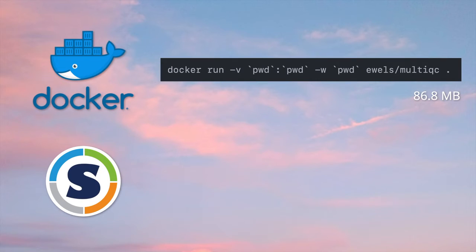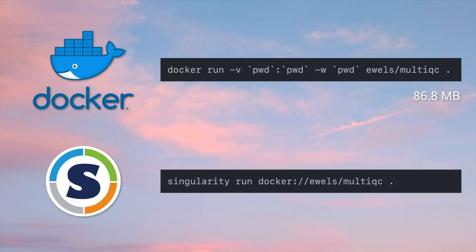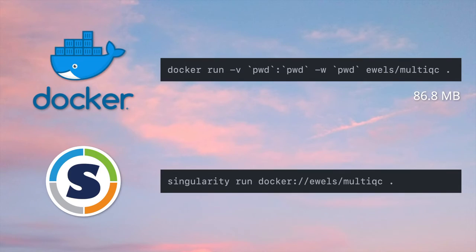The Docker image is very easy to run — just bind your directory and then run MultiQC with all the normal flags that you would normally. The container is very optimized, it's a very tiny file size, so it's quick to download. To use Singularity, you just point it at the same Docker container on Docker Hub, and Singularity will automatically convert this to a Singularity image.